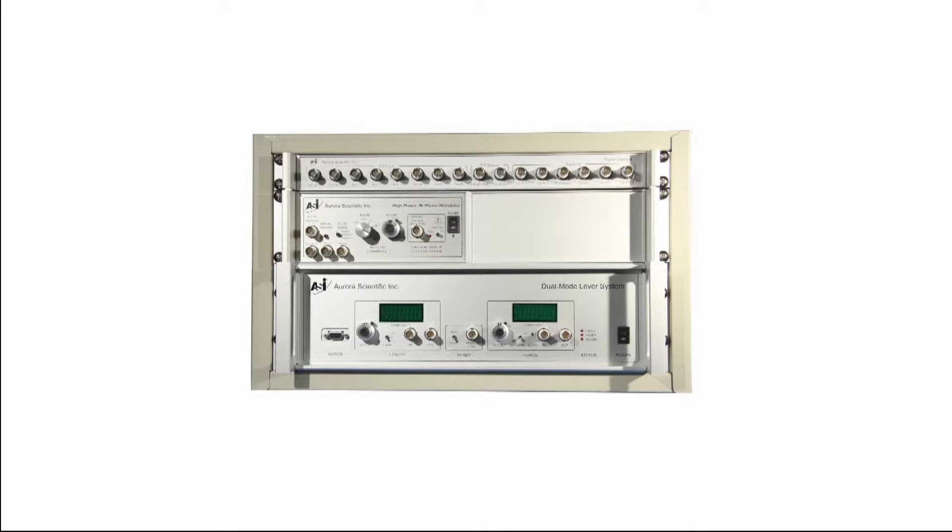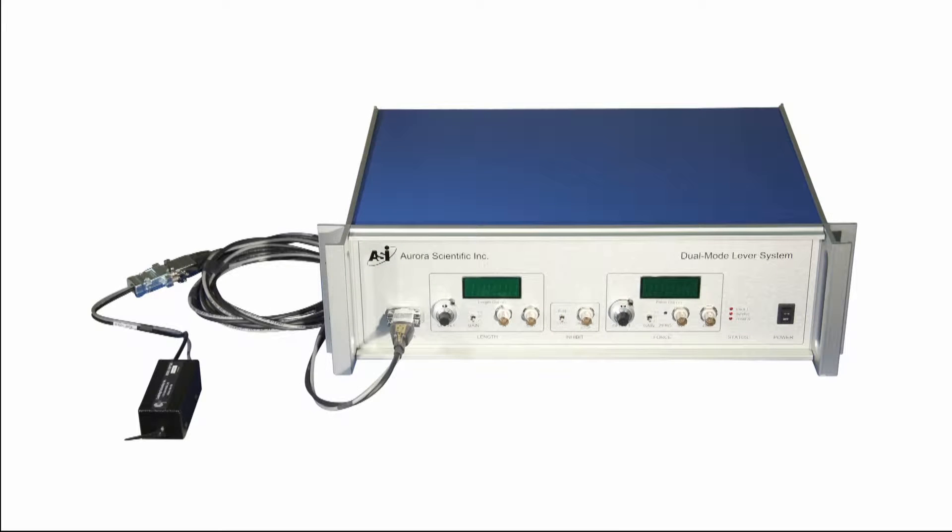Once you have chosen an appropriate location for the equipment, such as an instrument rack or laboratory shelving, you can proceed to set up and test your dual mode lever system.